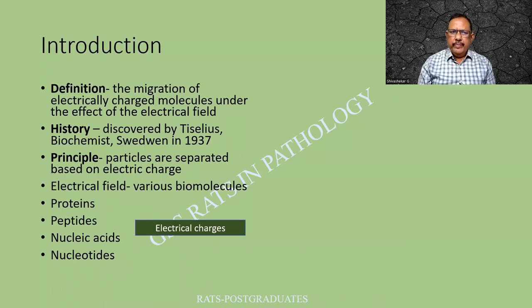An introduction. Definition. It is the migration of electrically charged molecules under the effect of an electrical field. It was discovered way back in 1937 by the person Tiselius. He was a biochemist of Sweden.